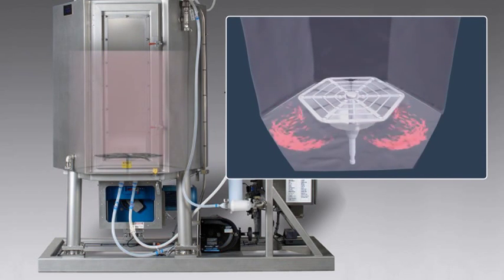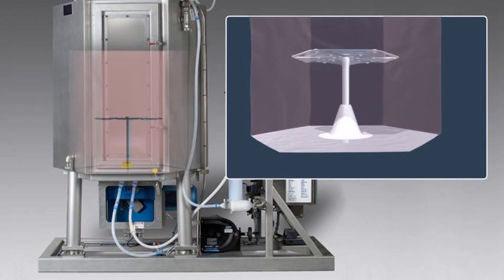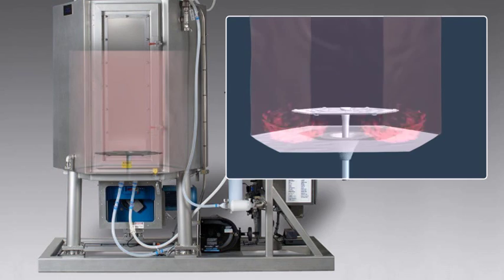After the product is mixed, one can transfer fluid out of the mixer with a variety of tubing extensions custom developed by ASI.